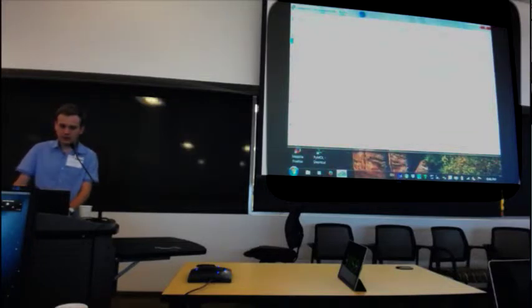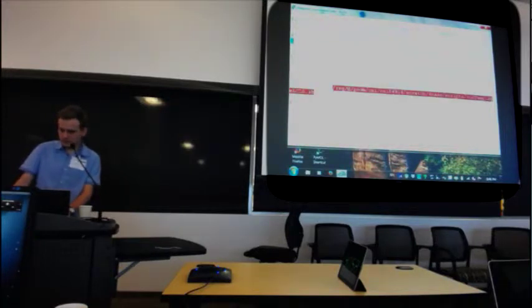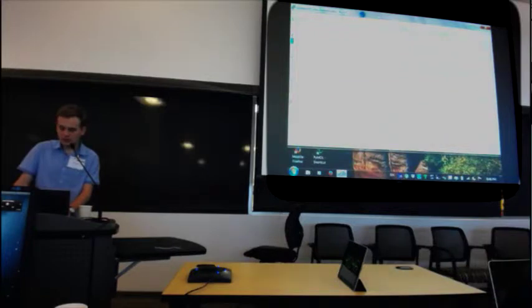Okay, so this is the ini template. That's just another program. This one. So if you would change it in our directory, you could probably not do anything, right? Exactly. So you should also change this line to your file name and your logins and CASS tutorial. Thanks.